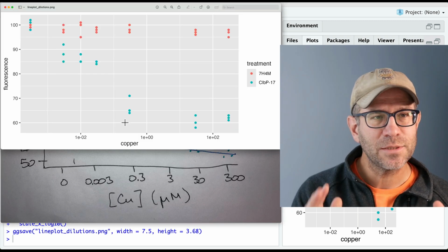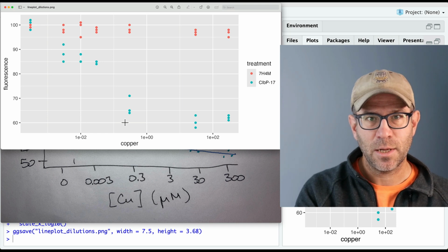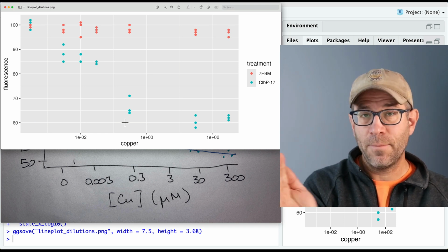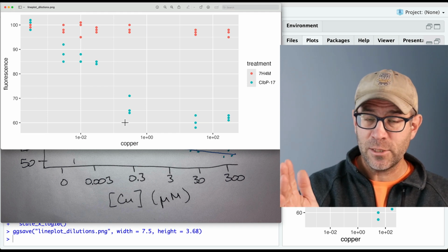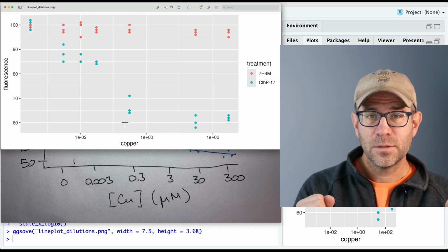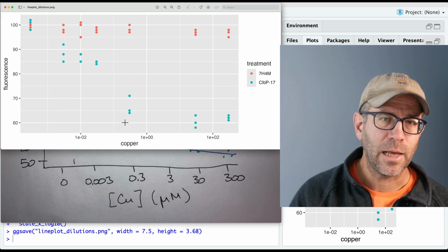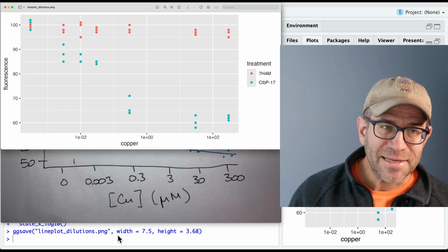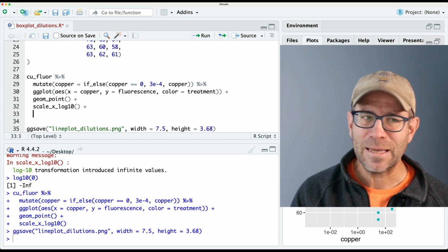That looks great. One of the things I wonder, though, is now that we don't have side-by-side box plots, if we can't make the figure a bit more narrow, right? It doesn't need to be so wide because we don't have so much information that needs to be shown. So we'll come back to that in a bit probably, but I do think we could probably pull that in a tad.